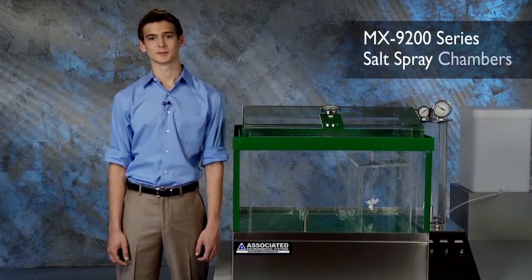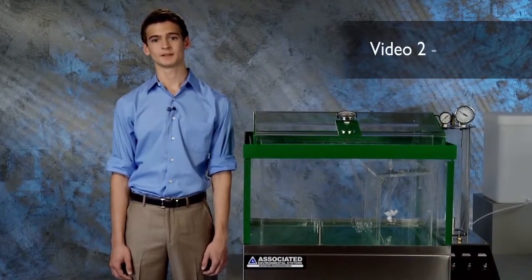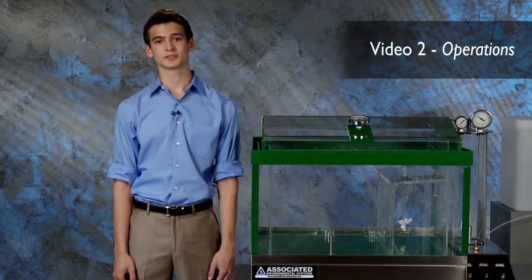Hi, my name is Jesse from Associated Environmental Systems. This video covers basic operating functions of the MX9200 series salt spray chambers.